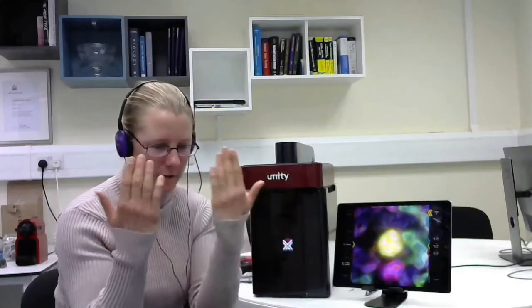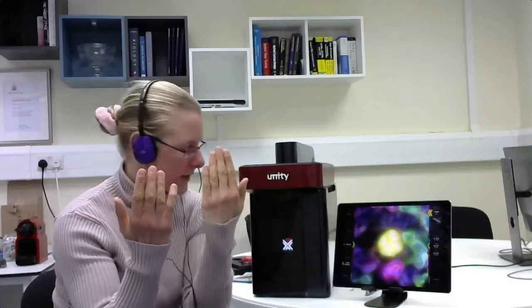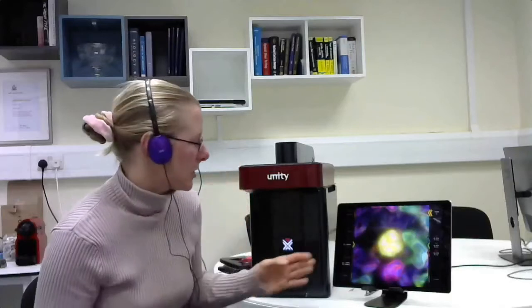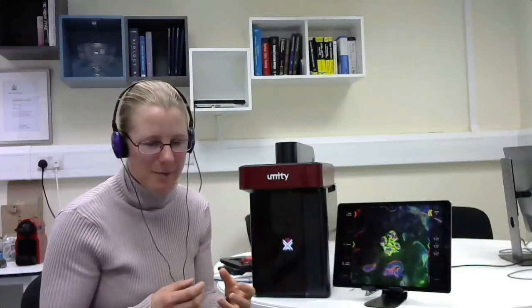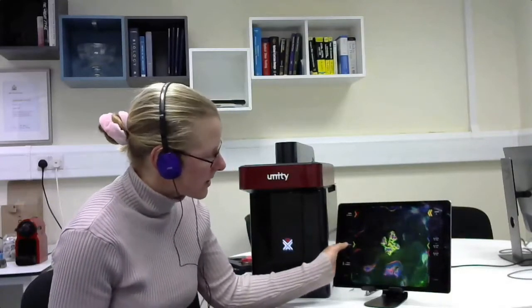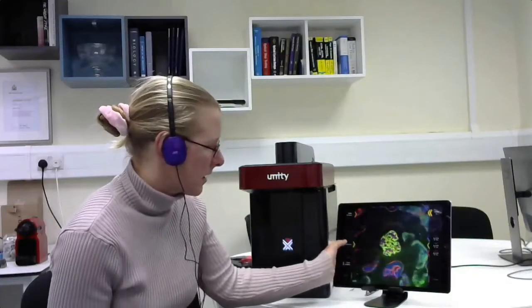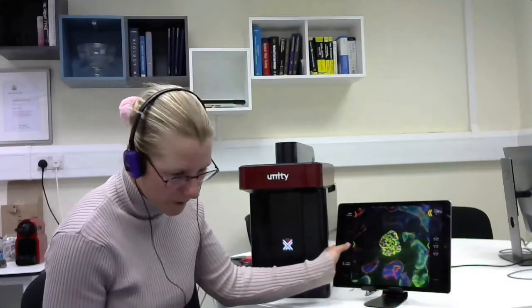When we want to go from our wide-field image to our confocal image, we subtract our reflected image from our transmitted image. Everything is live and on the fly, so we can go into a sectioned image really, really quickly. We have full control of the XY and Z, just like a normal confocal microscope where we're seeing our sectioned image. I'm just going up through the sample here.